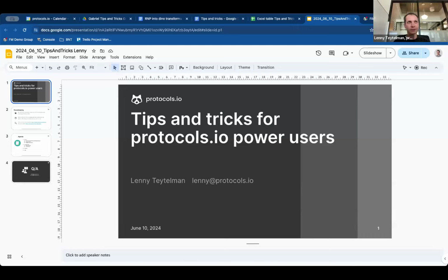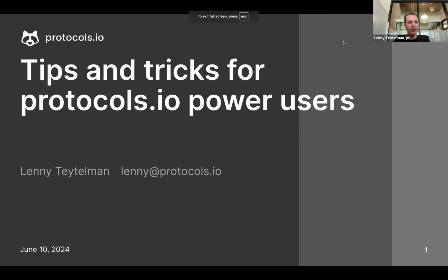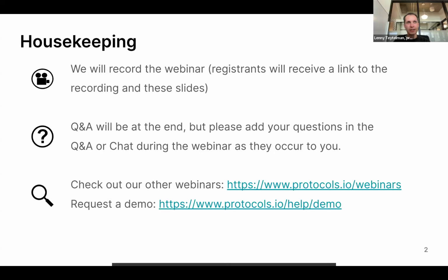I will share the screen. We don't have too many slides. This is going to be pretty much exclusively a live demo of some of the nuances of the platform.